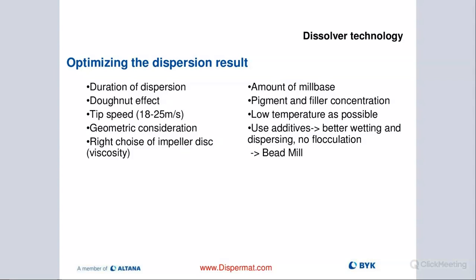So there would be cross-contamination. So it is also important to choose the right material of the disc. Mill base filling ratio: we recommend about 50% fill ratio of the container, anywhere up to 70%, but not less than 40. So 50 is optimum. If we go above 70, then we probably see some spilling when we put the energy in. So you don't want that.